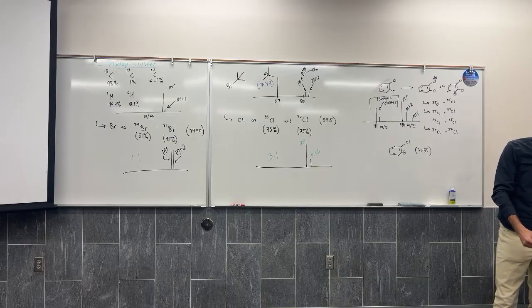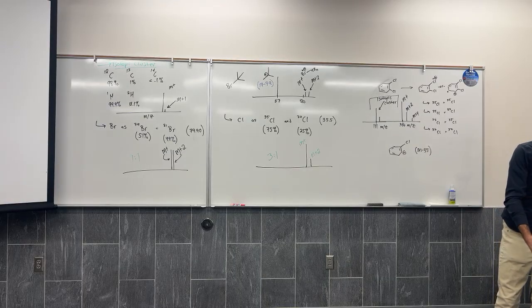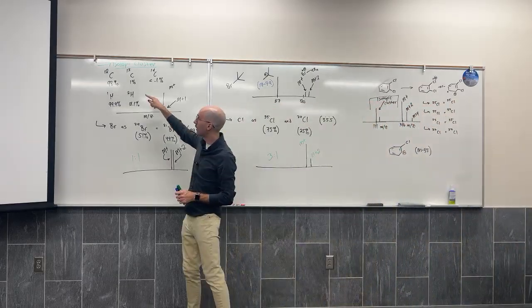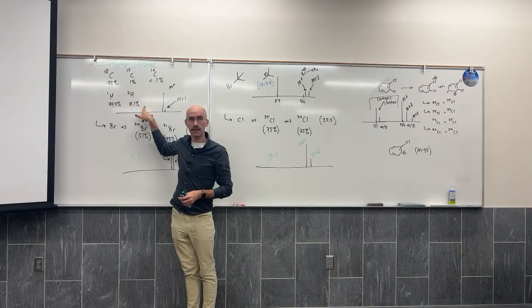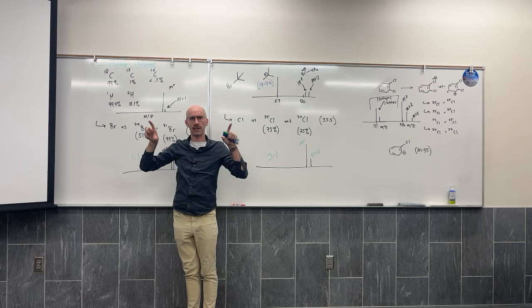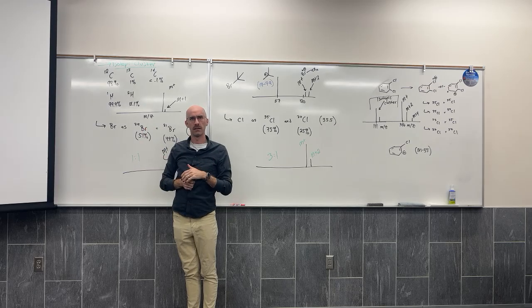More questions? I don't know that it's common for the rest of the halogens. And we know that it's not necessarily the most common thing for all of the elements. So yeah, I think it's coincidental that it's two major isotopes that are different by 2 mass units.